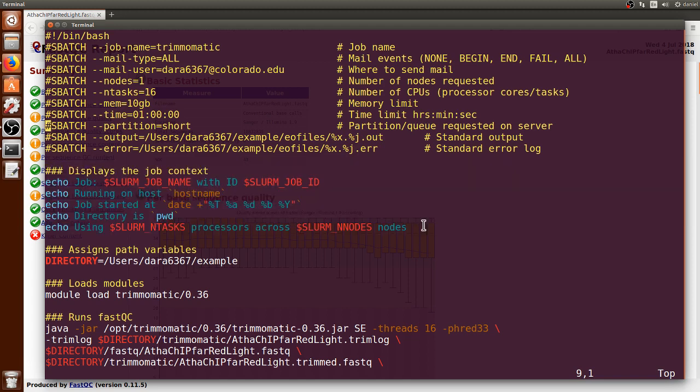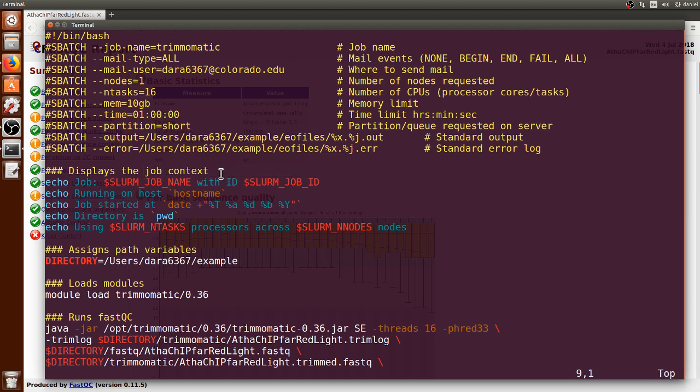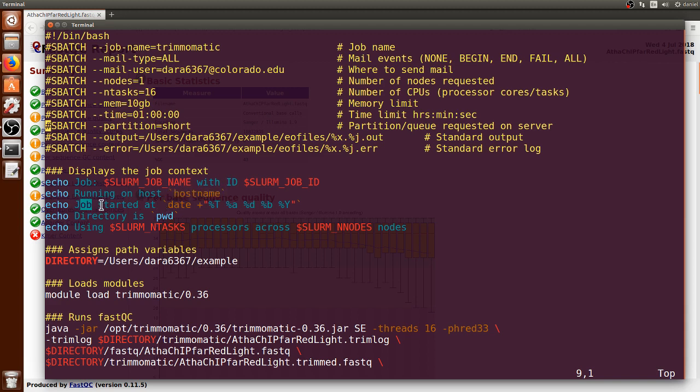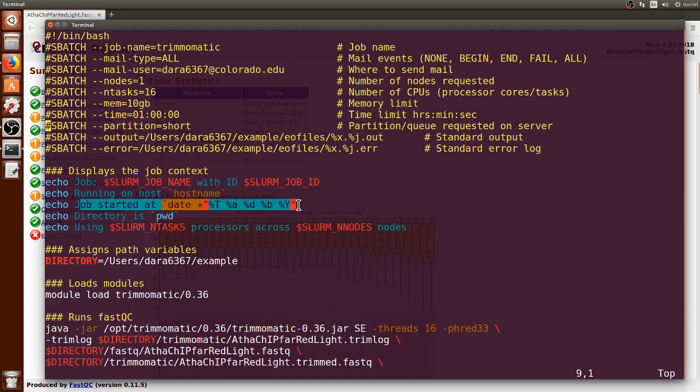This block of text is the documentation or job context that I would like to be saved on the output file, which will contain the job name, the job ID, the server in which the job was run, the date and time in which the job started running, from what directory it was run from, and how many processors and nodes it used.